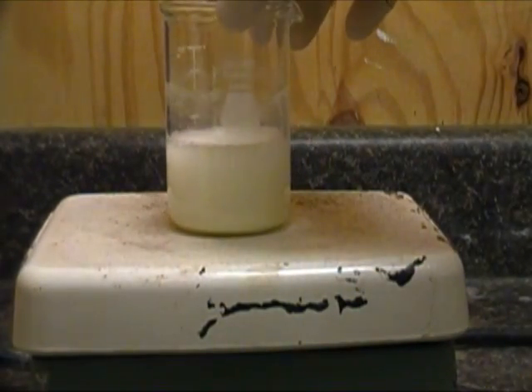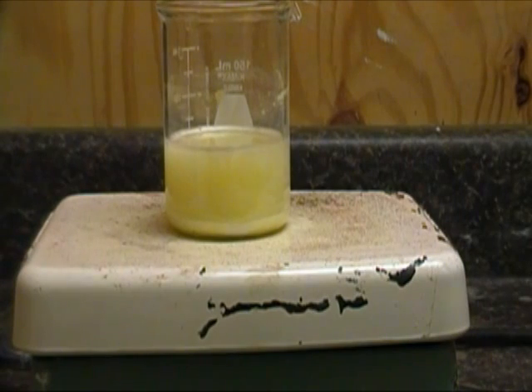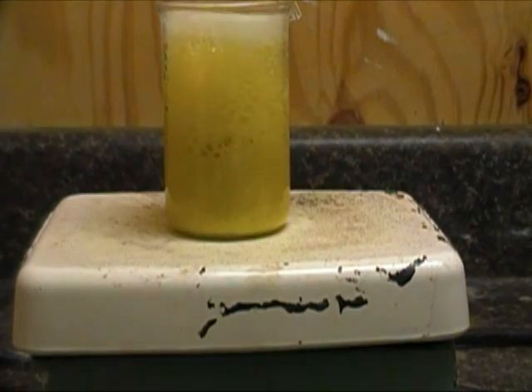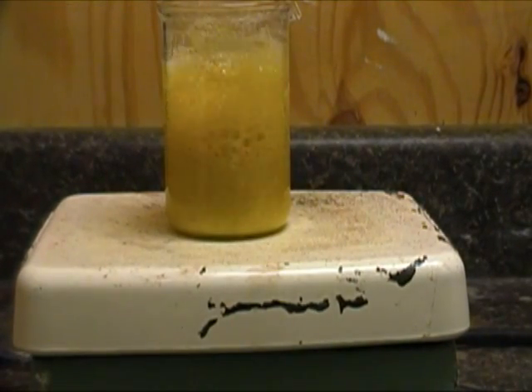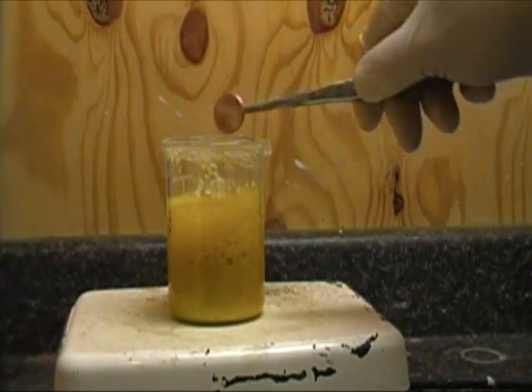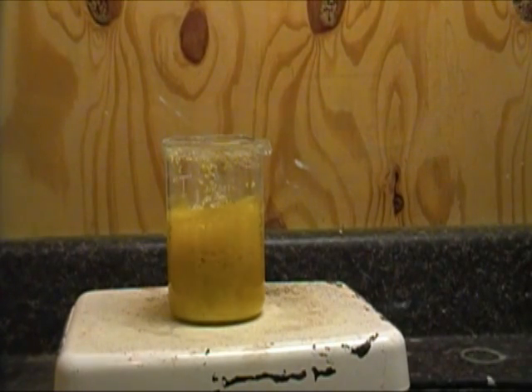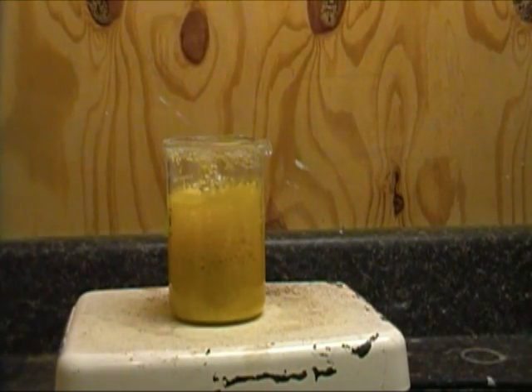Now place your beaker on a hot plate, turn to high heat, and bring the solution to a boil — we'll fast forward through that part. Once you've got a boil, you can grab a penny and place it in the solution. You'll need to leave it there for a good 30 minutes, which will give us time to ask the question: what is going on here?